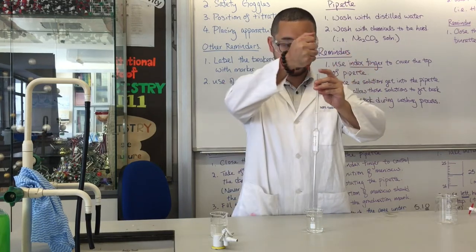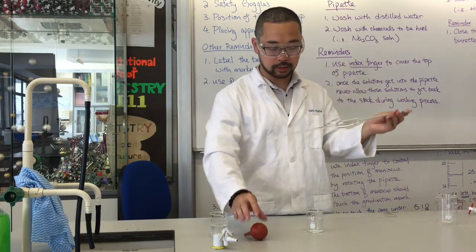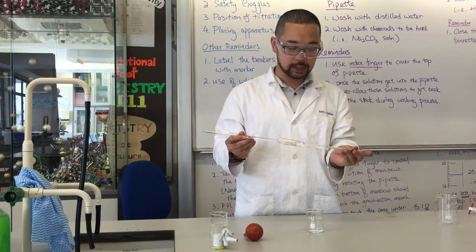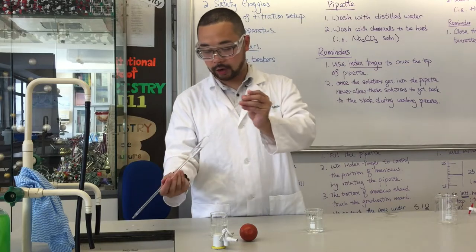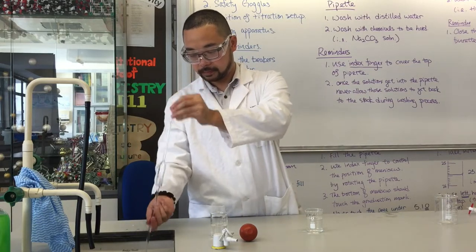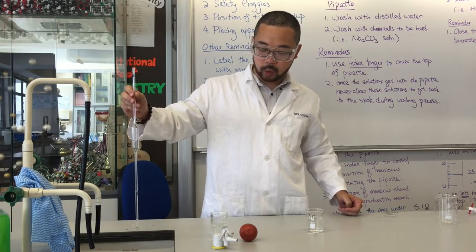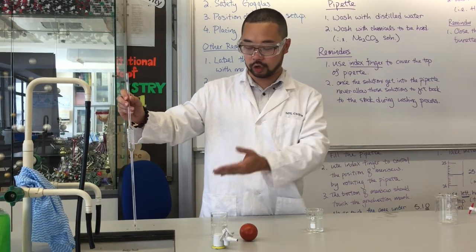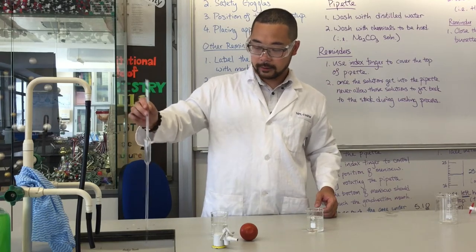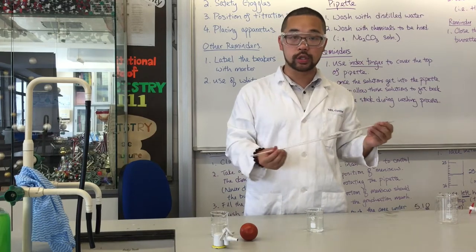So put the pipette into it, take up some solution until half full, and then we take it out, make it horizontal, and then rinse it. I'm rotating it. And when we drain it off, we shake it a bit. As we're using some weak base and also weak acid, actually both of them, it will be okay for you to drain it into the sink. So this one will be considered a clean pipette, and then you can use it afterward.